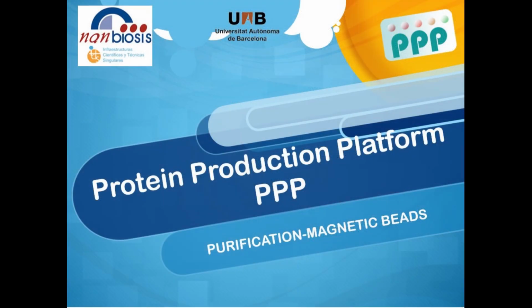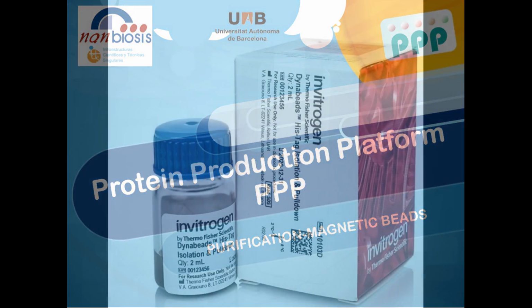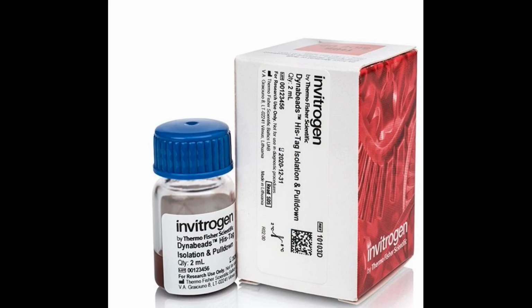Protein purification with magnetic beads. In the last part of this section, we are going to explain a protein purification method based on the protein affinity to functionalized magnetic beads such as Dynabeads.